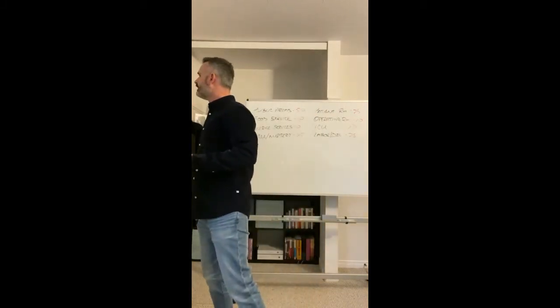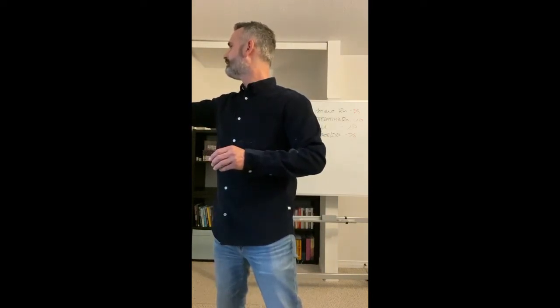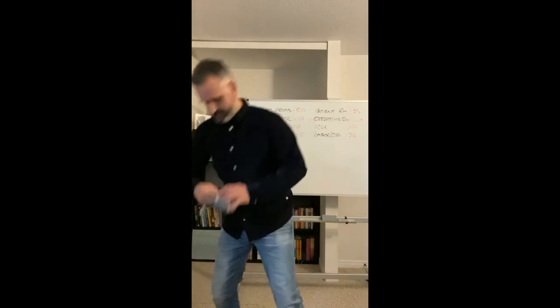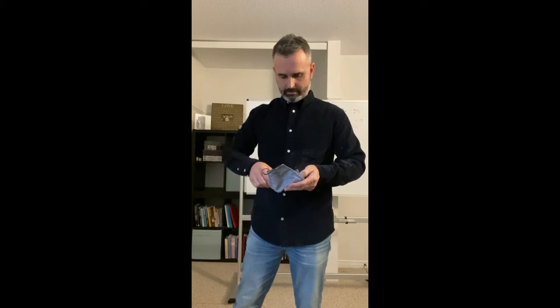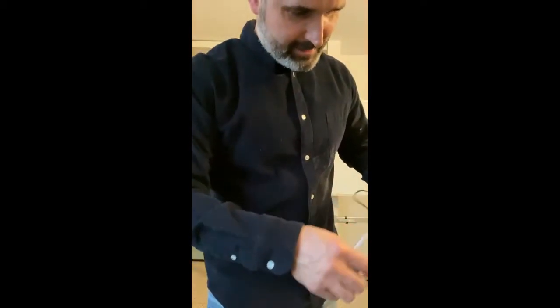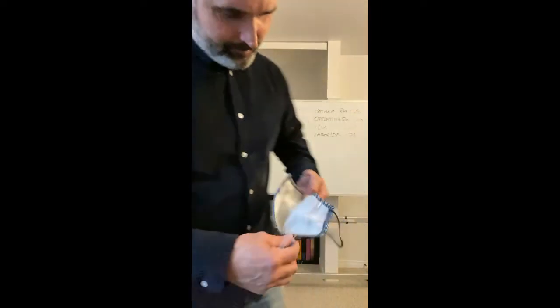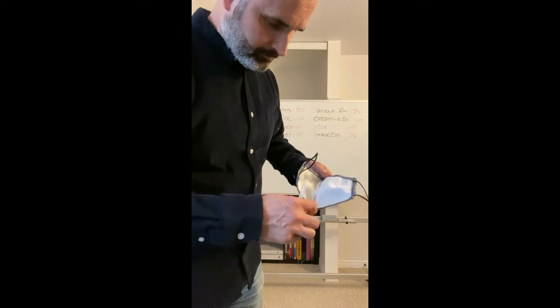And we will go to this mask. So this has definitely been worn a couple times. So again, take our swab. We'll get all on the inside here. You can see it's not that dirty or anything, but definitely been worn 2 or 3 times.